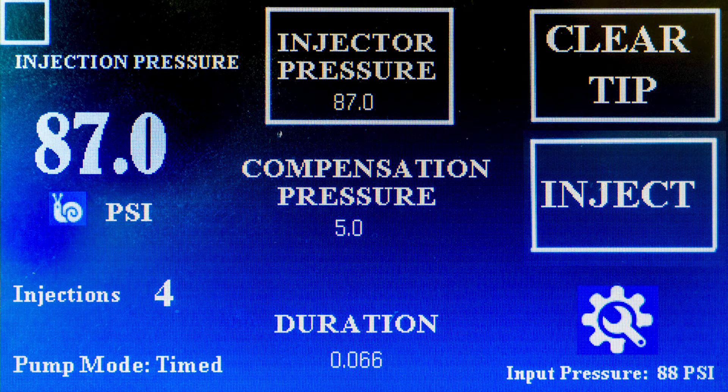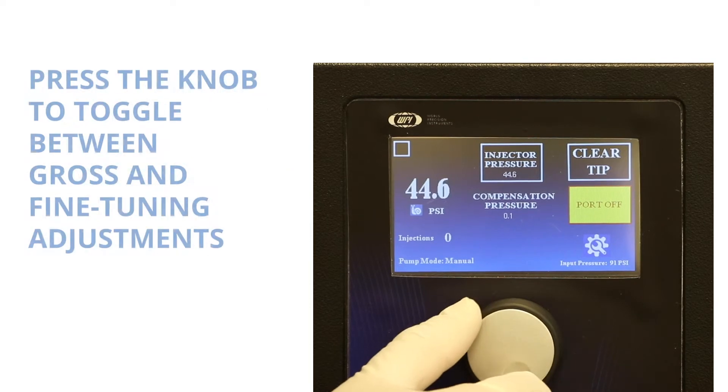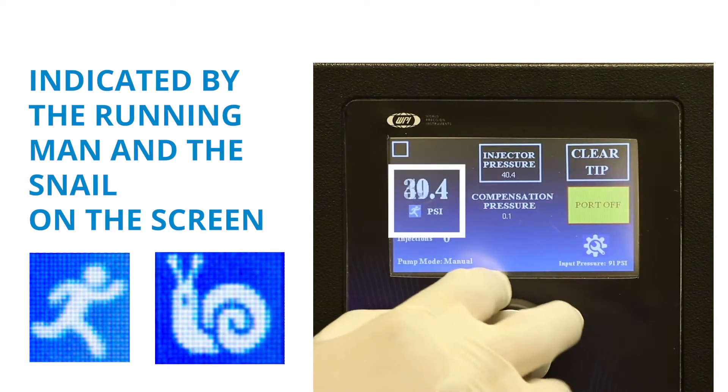Each one of these settings is controlled by touching the parameter and rotating the knob to modify it. Press the knob to toggle between gross and fine tuning adjustments, indicated by the running man and the snail on the screen.